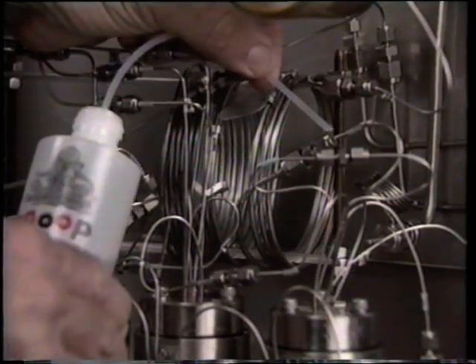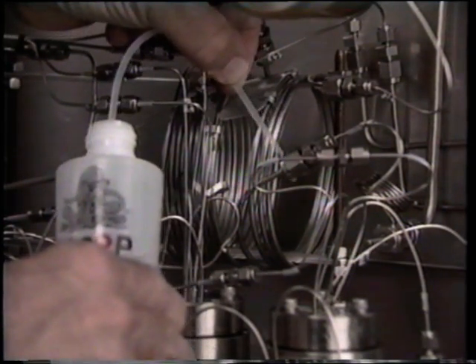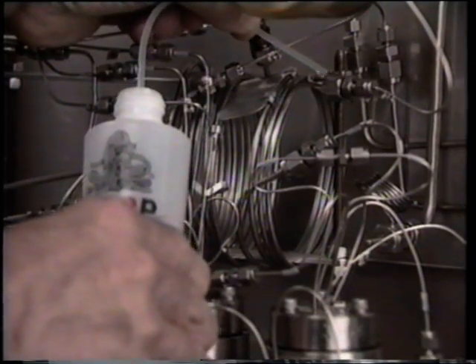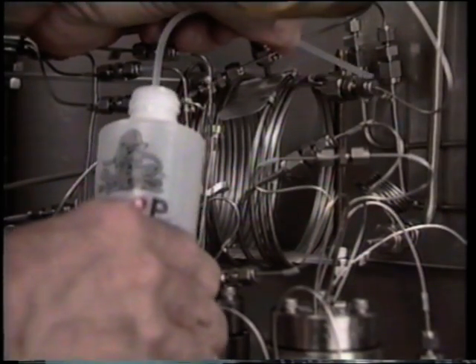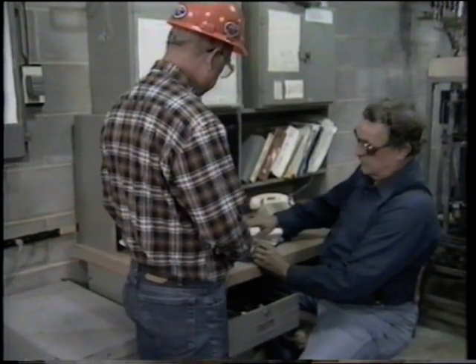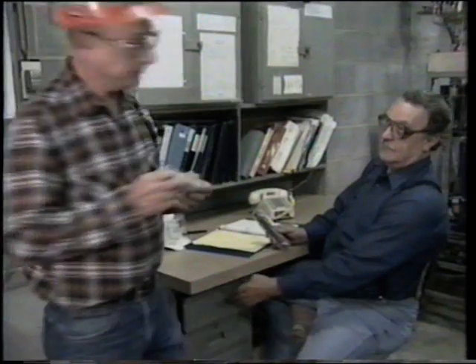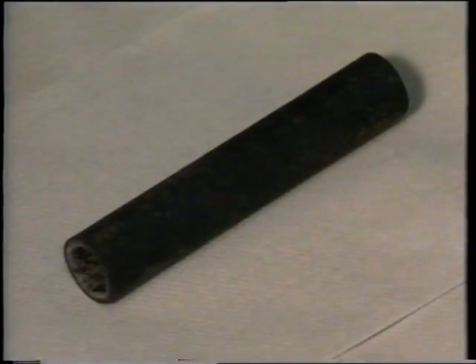If you suspect a leak, use a leak detector to determine its location. If no leak is found, check for blockage. Since all filters eventually block, most manufacturers recommend routine filter replacement. When selecting a filter for replacement, be certain to use the correct filter for the process and for the type of analysis. If blockages are causing too much downtime, it might be necessary to reevaluate your filter maintenance schedule.